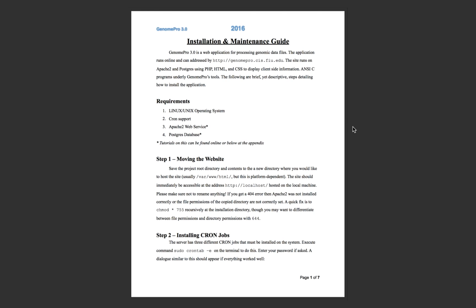Hi, my name is Daniel Gonzalez, and I'm going to be walking you through the installation and maintenance guide for Genome Pro 3.0.